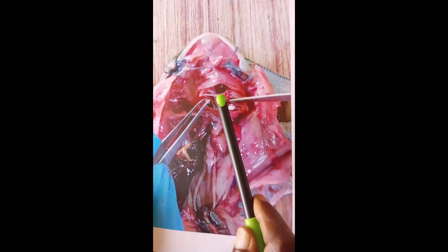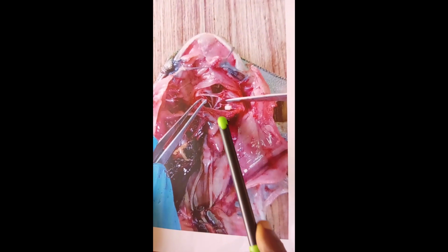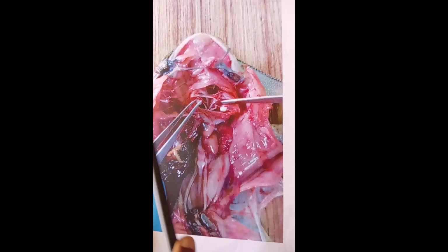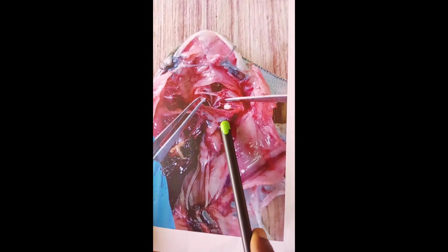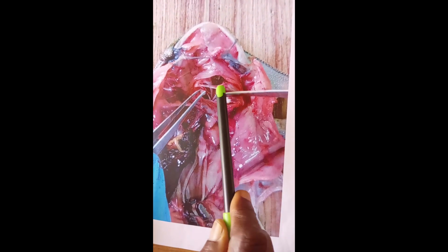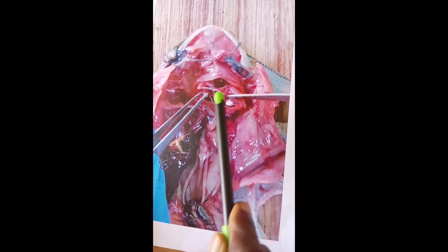Good. Now, when air is pushed from the lung, it causes the vocal cords to vibrate and sound is made. That's how sound is made. And then these are the vocal sacs. When air is pushed from the lung, it causes the vocal sacs to inflate, and then they amplify the sound of the vocal cords, and then croaking is done.